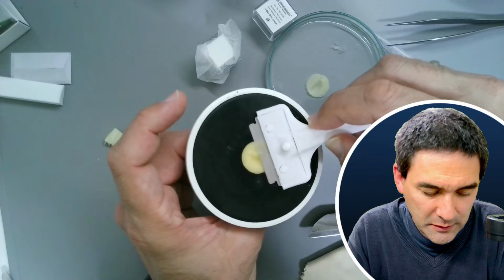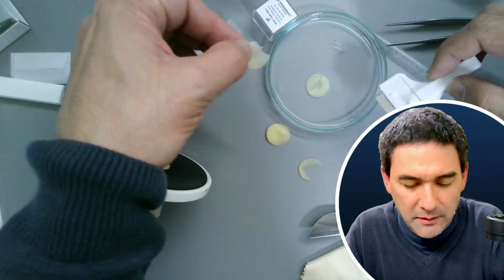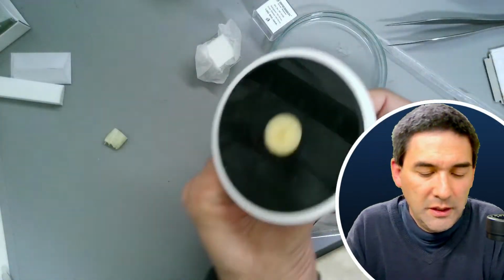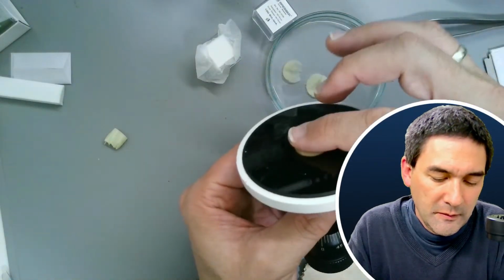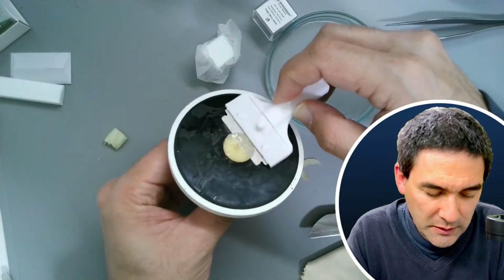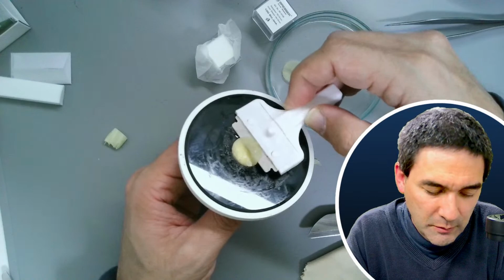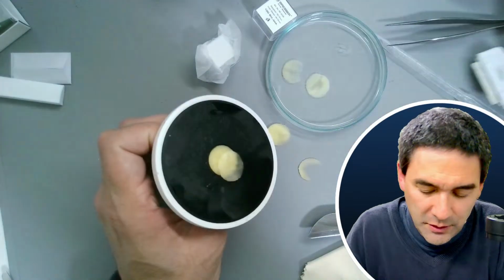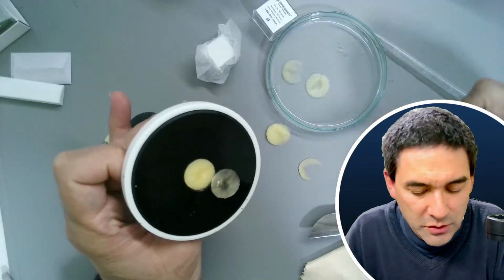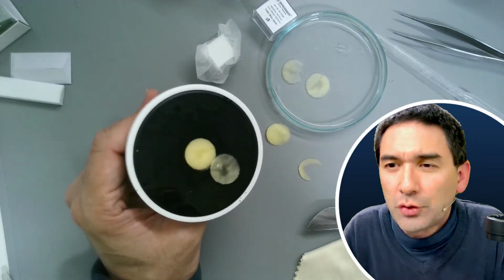Yeah, this is a little bit better. The potato is quite, here I think it's quite thin. So make sure that it's not going up too much. Yep, I think I'm just going to try it and see how this works. This one is also quite thin. So actually it looks quite okay. So I'm going to try to put this under the microscope and we should be able to see a couple of starch grains.